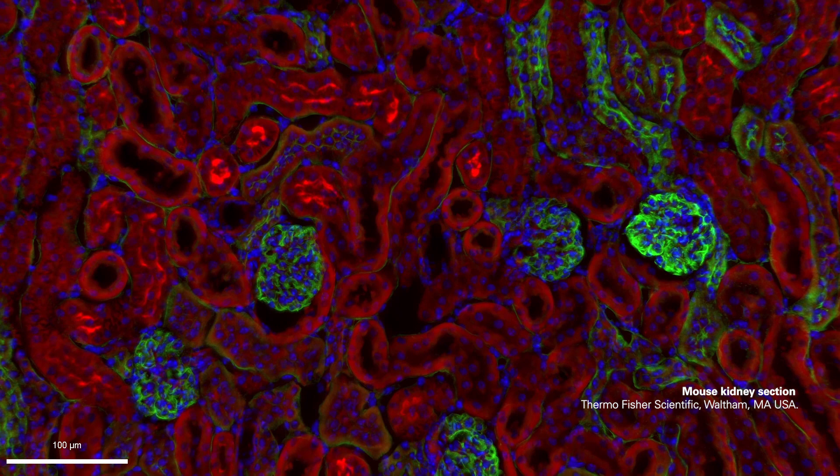This is why we're so excited about Thunder, because Thunder now enables the meaningful use of tissue sections.